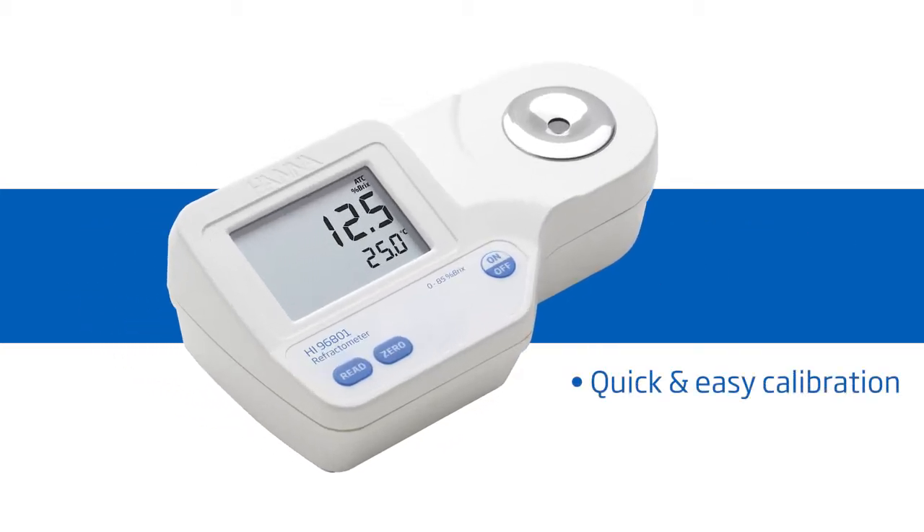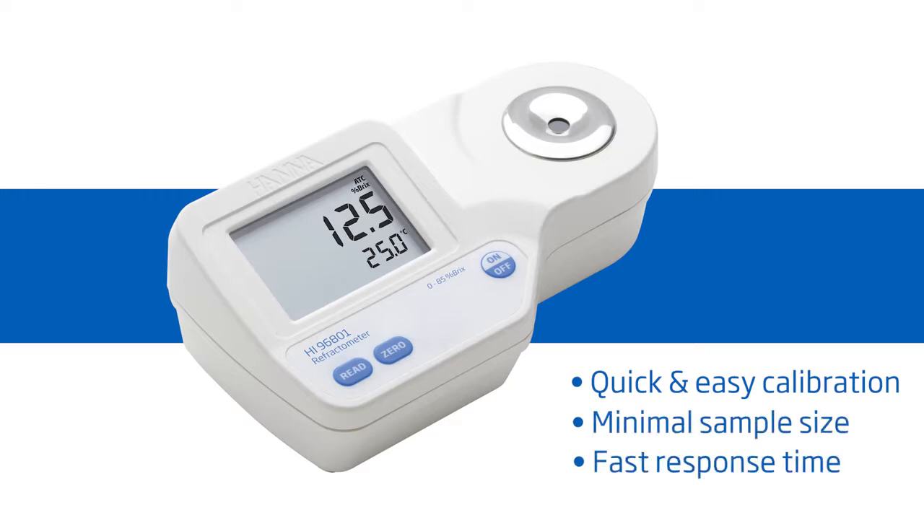It features one-button calibration, two-drop sample size, and a 1.5 second response time.